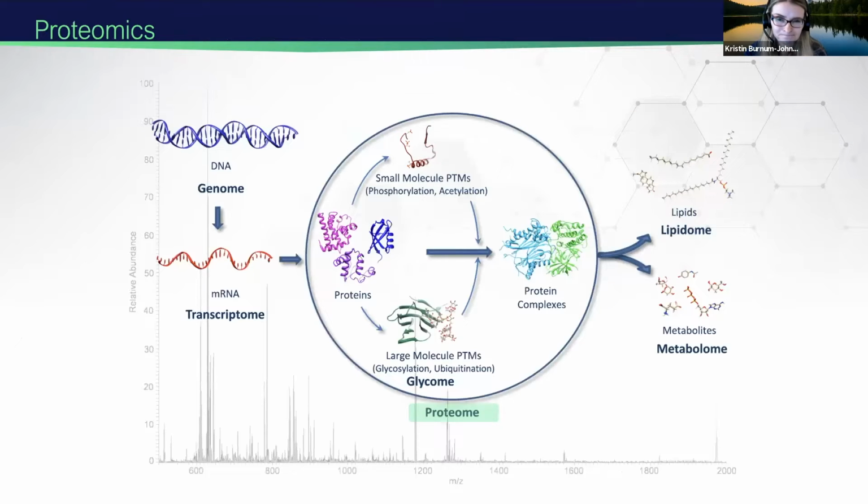So proteomics is a high throughput approach to quantify protein levels, but these measurements enable not only the presence and abundance of proteins, but they can also provide an understanding of the structure, the function, and the interactions of proteins. So if you look at this figure, the proteome circle in the center of the slide depicts how you can study the proteome in biological systems.